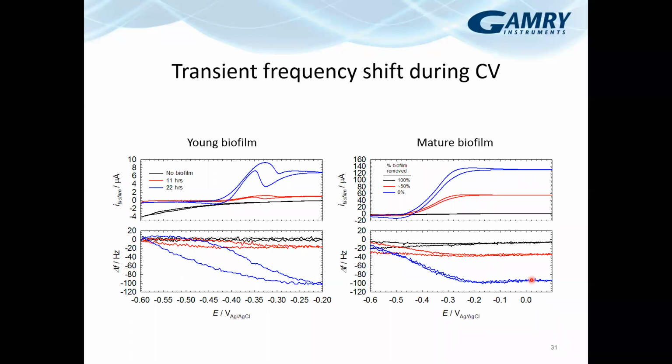In my experience, for example, glycerol. If you ever work with glycerol or syrup or anything of that nature, you'll know that it actually completely arrests the resonance. So in other words, the damping effect of the solution is so high that it actually quenches the resonance, and the electronics cannot output enough voltage to drive that crystal.